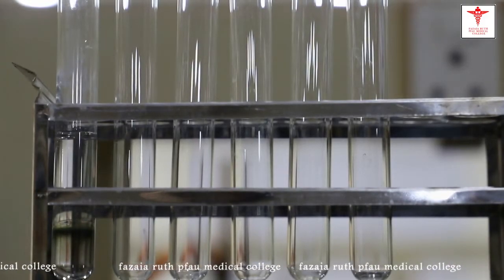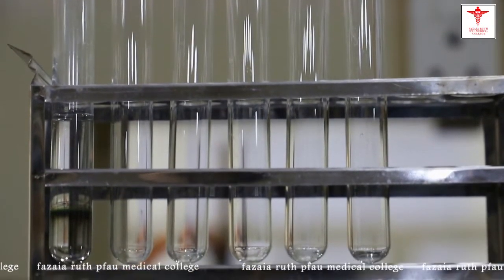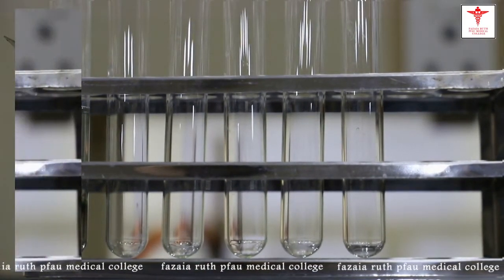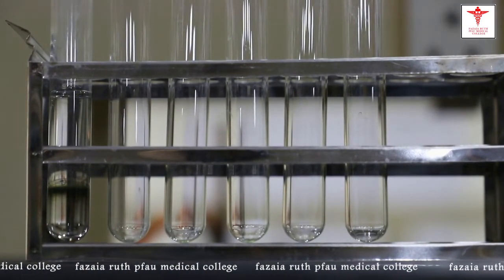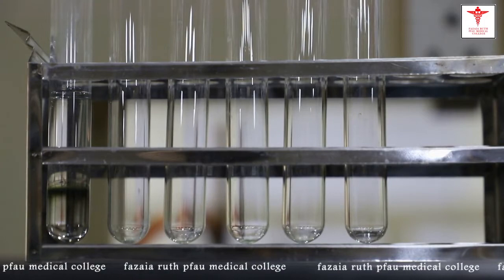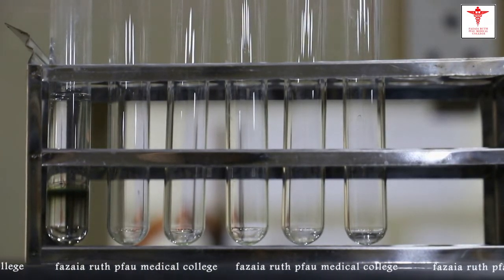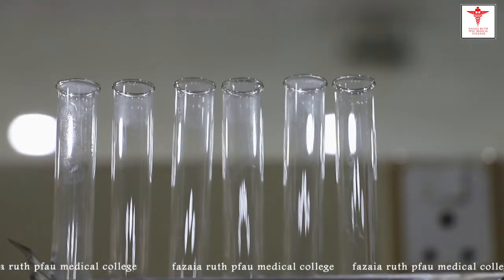So this was Molisch's test. Now you can see in this test tube that there is a ring formation at the junction of 2 solutions. So formation of this ring is telling us that this test is positive and the given sample contains a carbohydrate in it. Now the second test, which is iodine test.